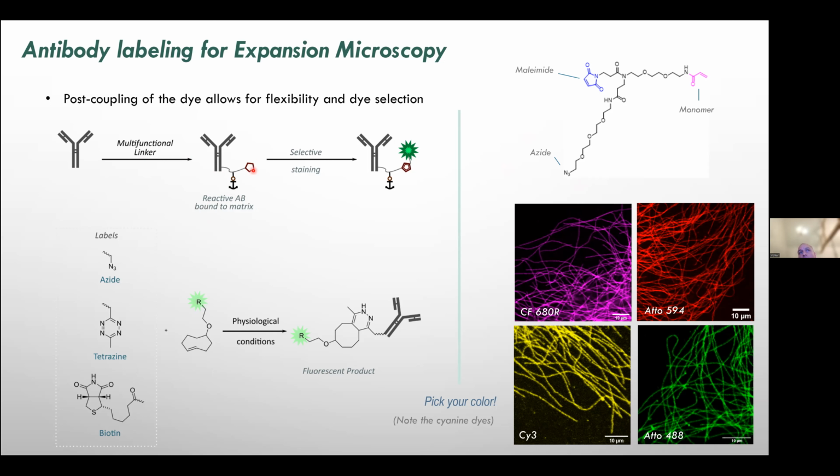at that time, and then once your gel is formed or expanded, you can always add a dye, and you can generate your signal. And what's the main advantage here is that you can get access to dyes that would otherwise degrade in expansion microscopy. I'll come back to that dye effect a bit later in the presentation.